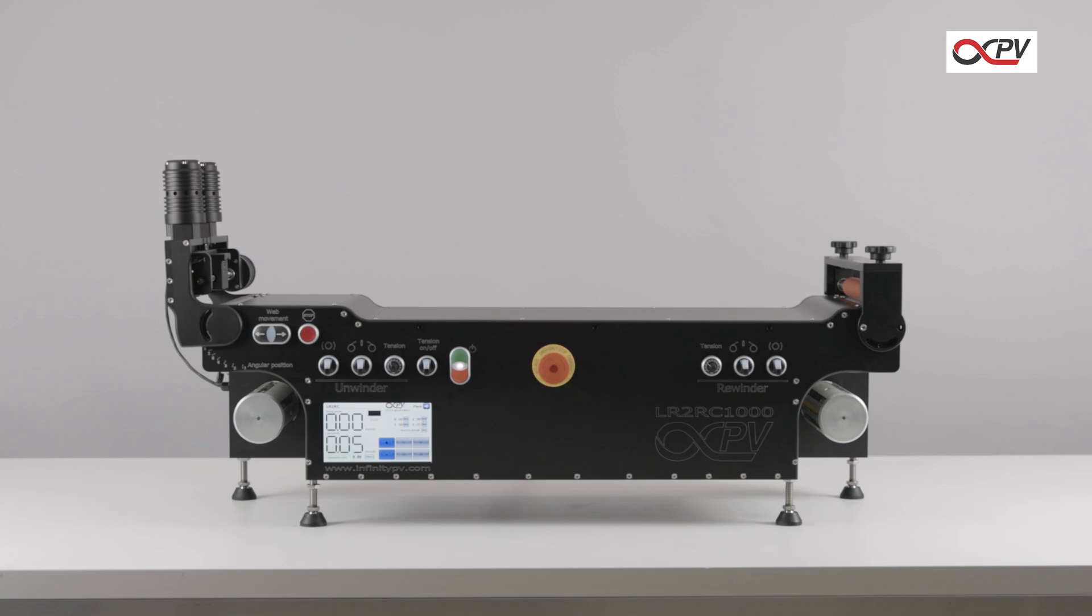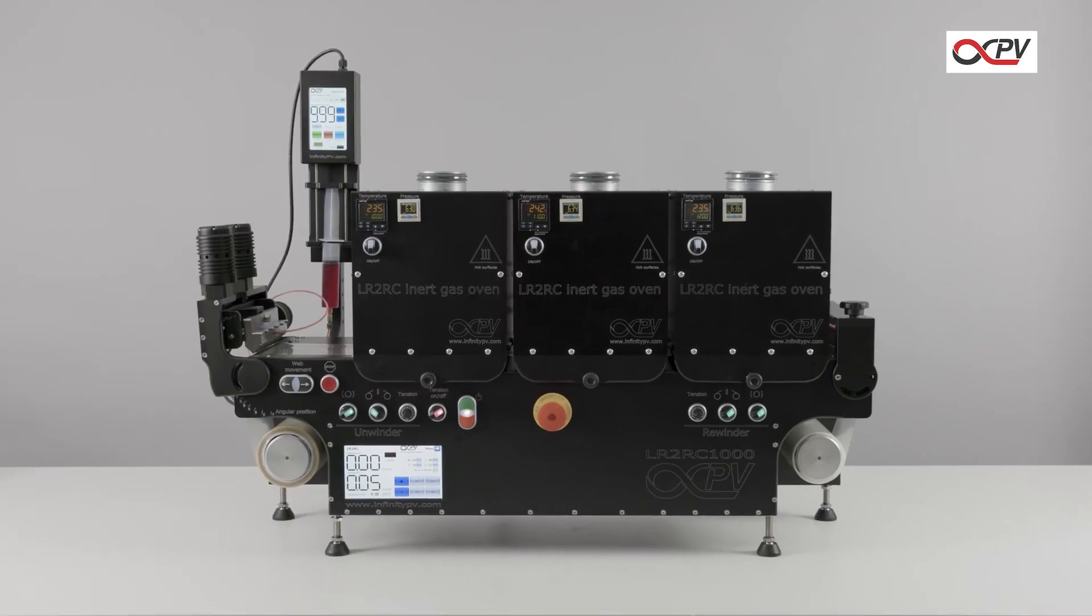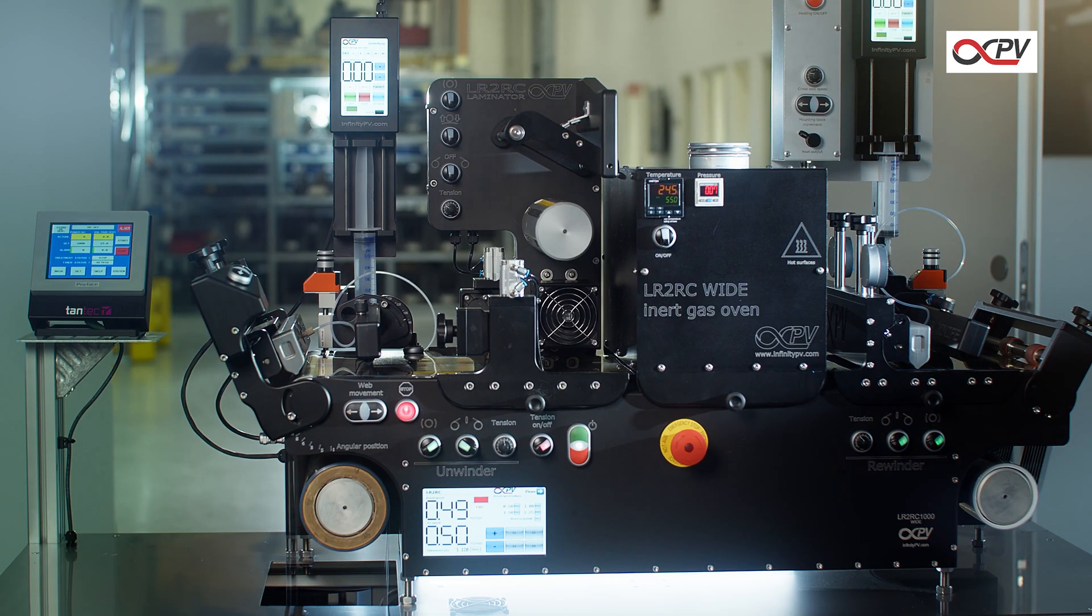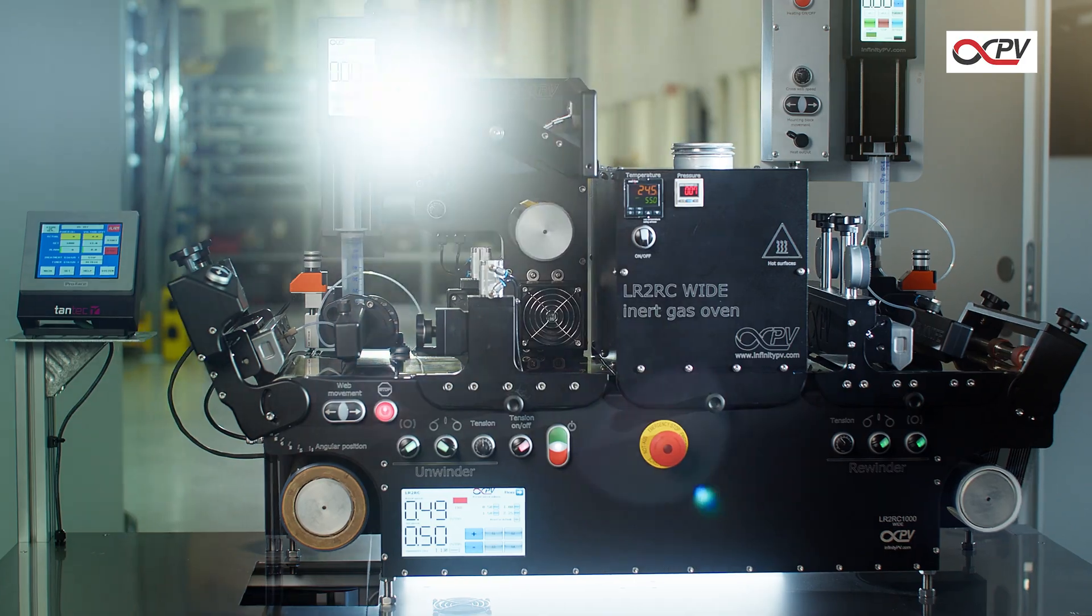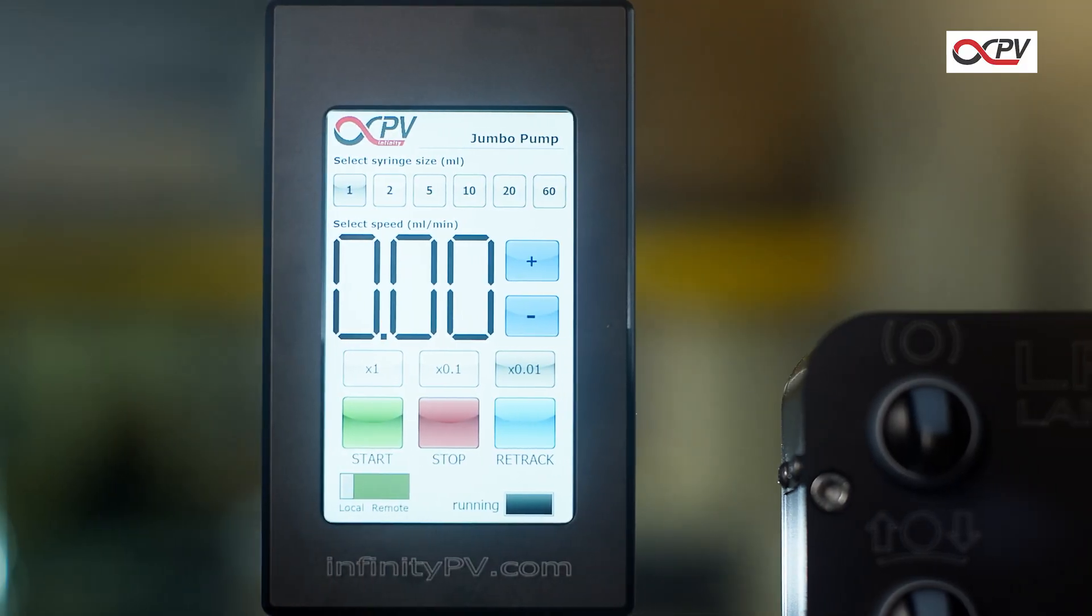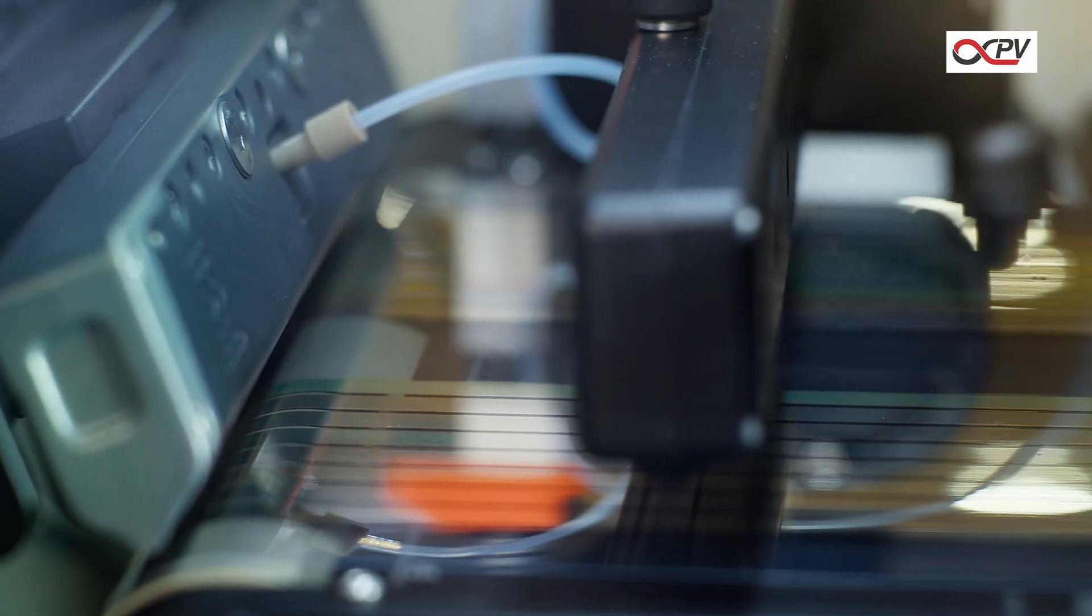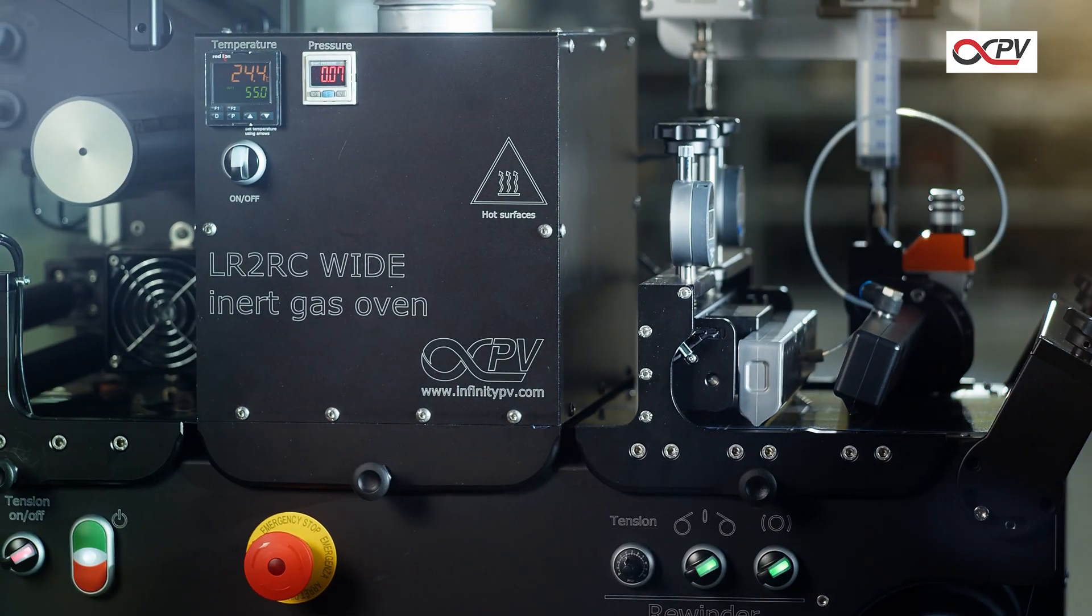As a part of the modular laboratory roll-to-roll coater platform, the slurry coater can be tailored to meet the specific needs of your process. Combine it with pumps, ovens, laminators, surface treatment, anti-static bars, or air knives.